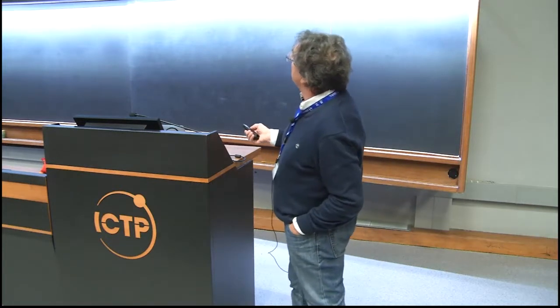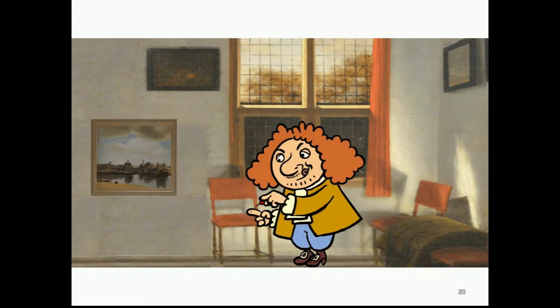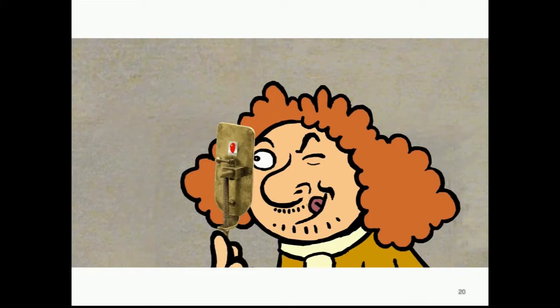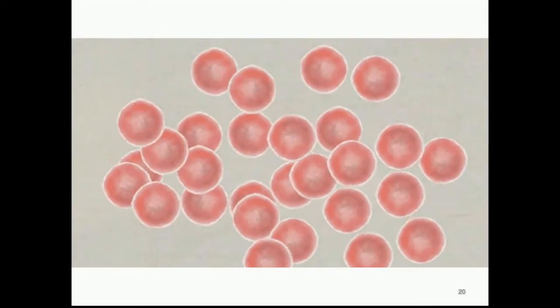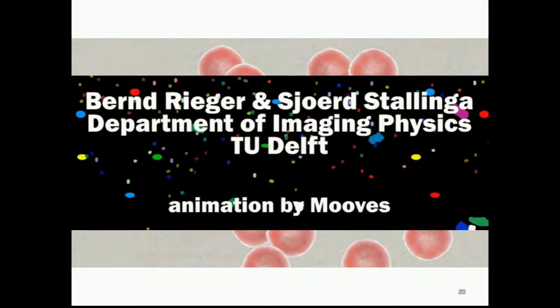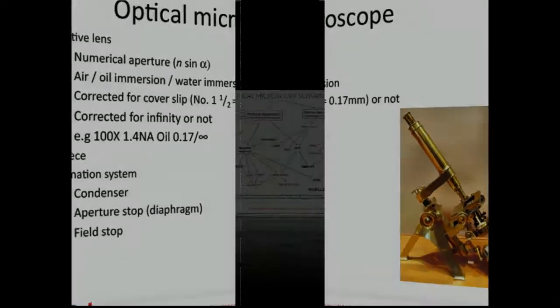So these are the windows that we will try not to touch too much. And using the microscope, this was an observation using a contrast that does not induce too many transformations within the sample. You heard about the optical microscope, so you know about all this stuff. You had beautiful lessons last week. I've seen all the slides there.